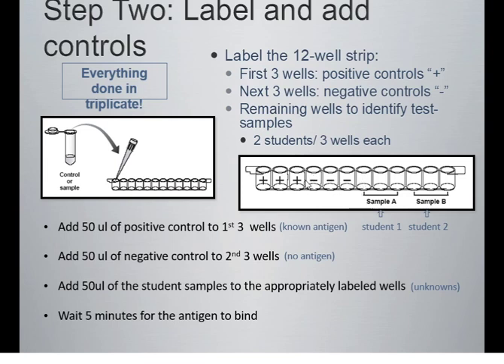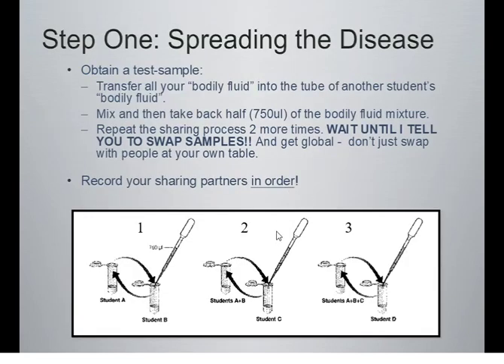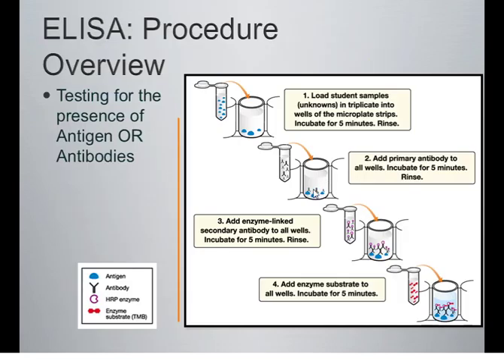So that's why you have these negative controls. You've got to make sure that between the first and the second step, you coat the bottom of the plastic, any space that's available, whether it's the positive or negative, with that detergent to make sure that none of these primary antibodies bind to any other surface except for the protein that you're interested in, because they themselves are proteins. That's what antibodies are. But these antibodies will specifically bind to the protein that you're interested in.